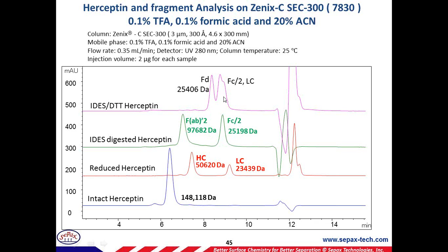Due to the closeness in molecular weight, the Fd and the half of the Fc are not resolved, but you can determine those masses from those peaks, and maybe a smaller pore may be applicable to this specific sample mixture.